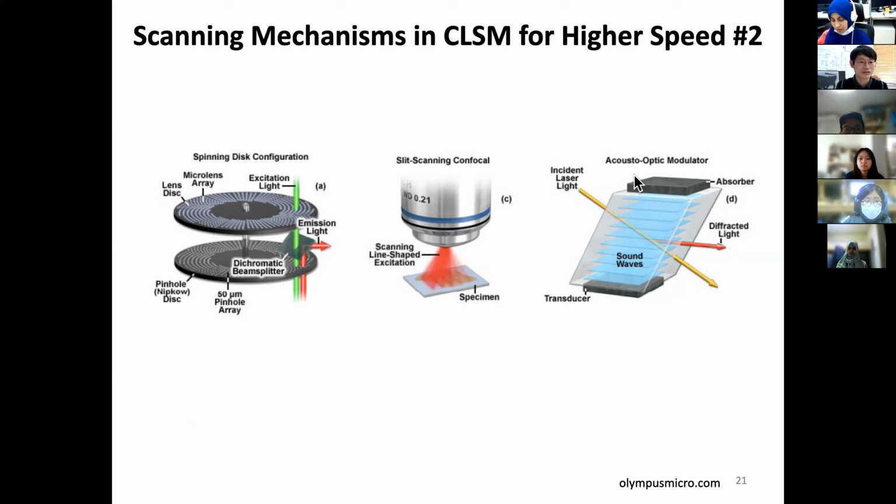One way, as you've learned from Fourier optics or grating: we can have a crystal and send ultrasonic sound waves to make a standing wave, then you can create an arbitrary grating. Remember, the grating has a diffraction angle, and the first order depends on the period of the grating. So if you can change the sound wave frequency, this diffracted first order light will change.